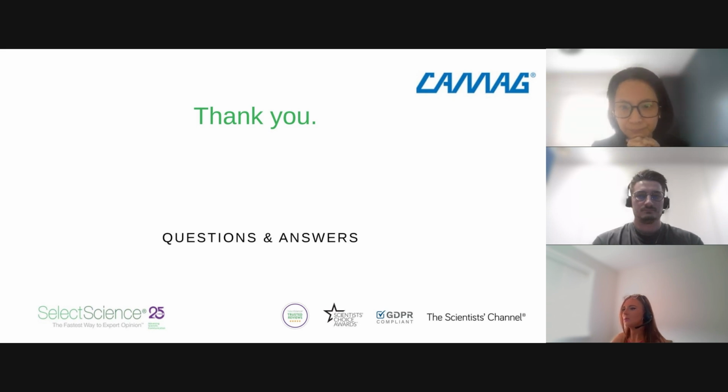That's great, thank you. This next one here is, what is the modification for the AS modified? And in brackets here, concentration or other. Yeah, actually, it's the concentration of the ingredients that are inside the anisaldehyde sulfuric acid, and also the heating step. It's longer with the modified one, so like this we have a difference of color too. So this recipe will be inside one application note that we will produce soon related to this case study. That's great, thank you, Tian.